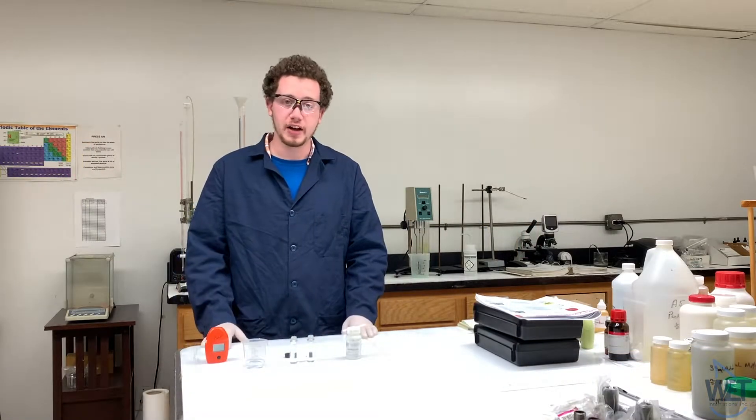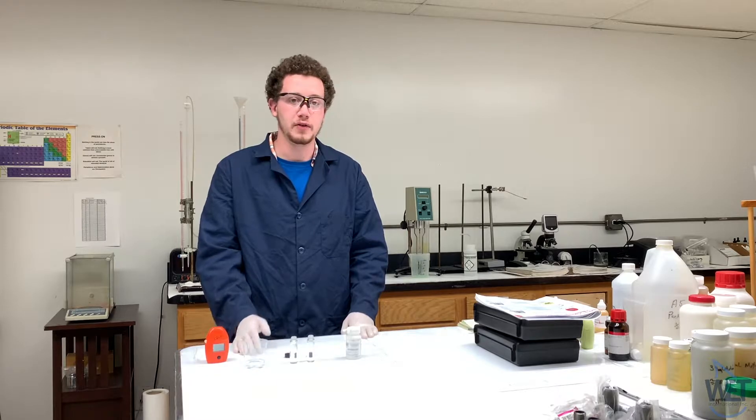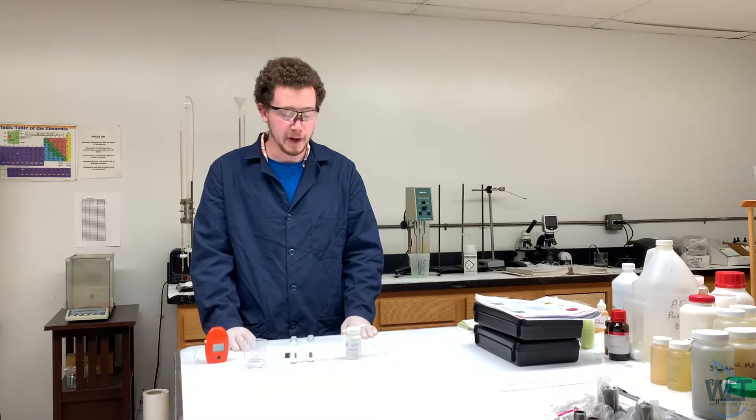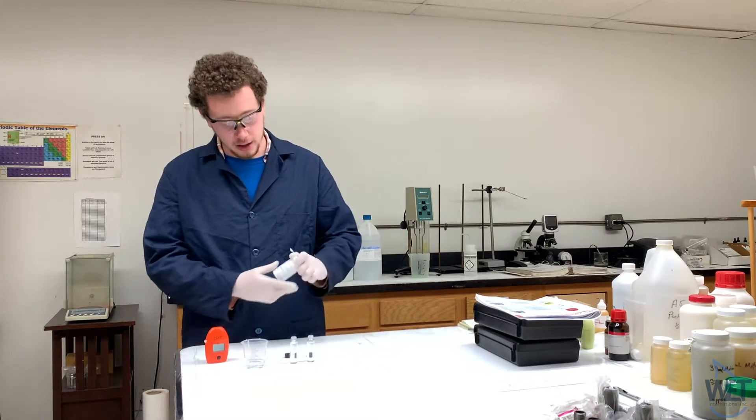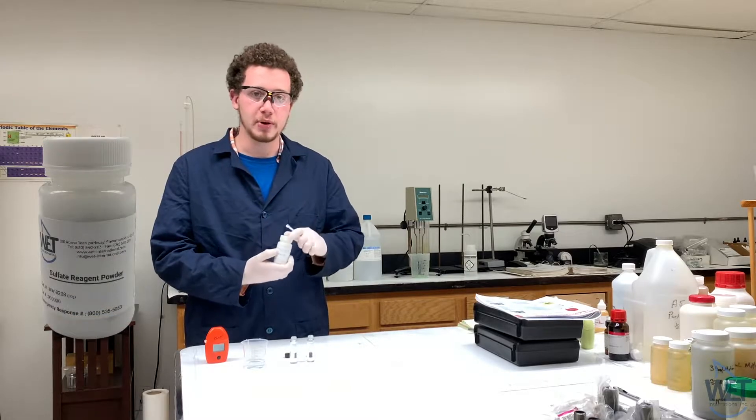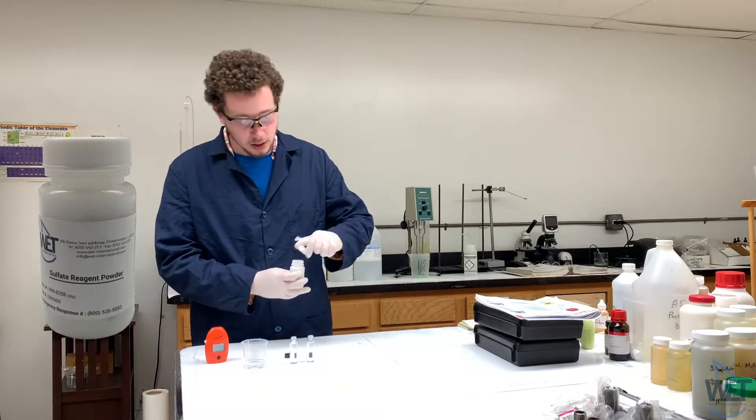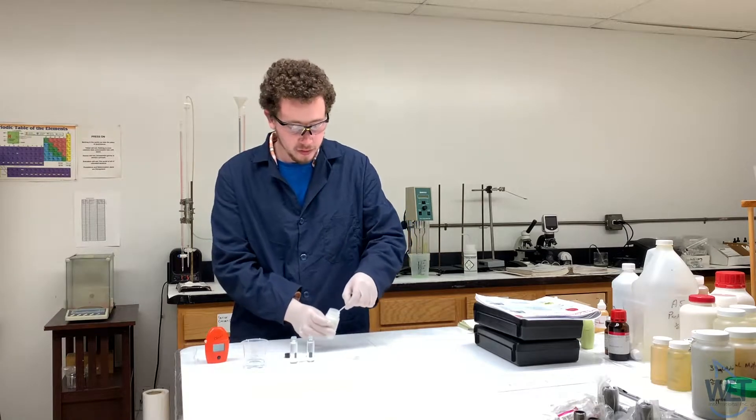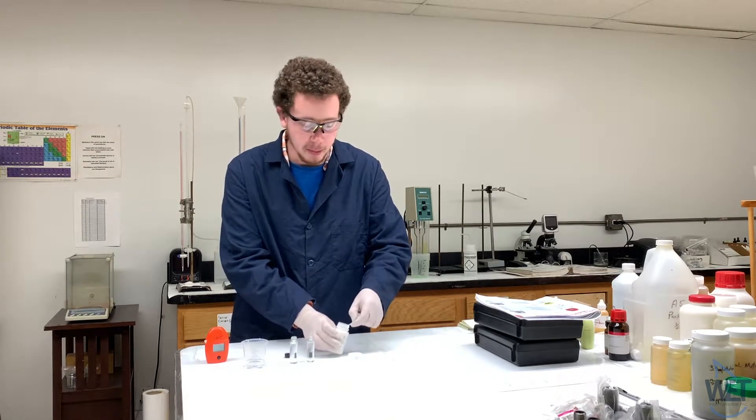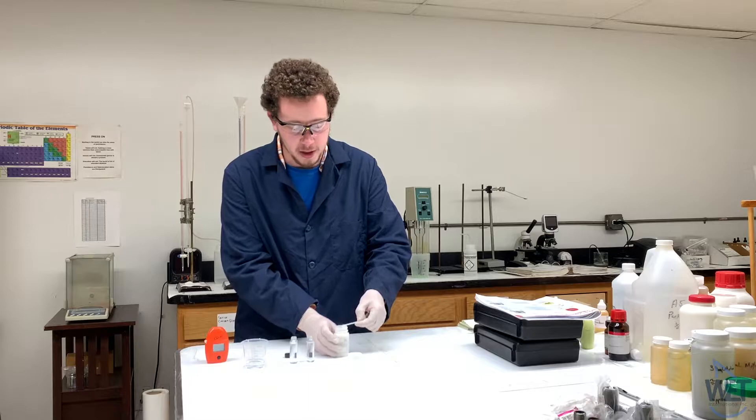This red one works at a wavelength of 525 nanometers. To test for sulfate, you'll take your sample and fill two vials to the 10 ml line. Then you will take your sulfate reagent powder and add one scoop to what will become your test sample, and the other one will remain your blank.